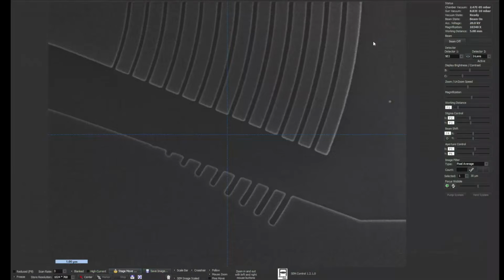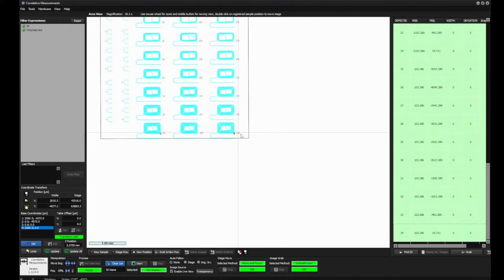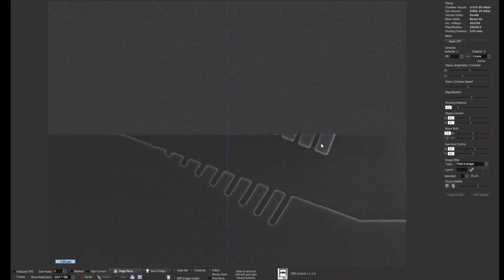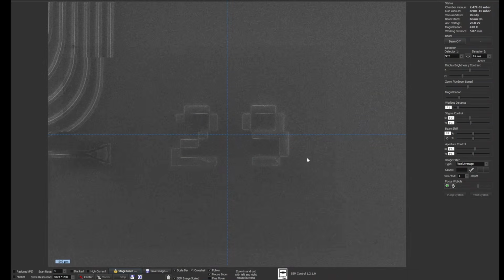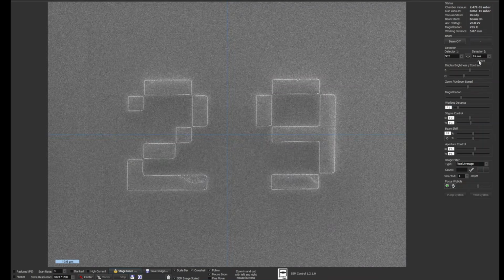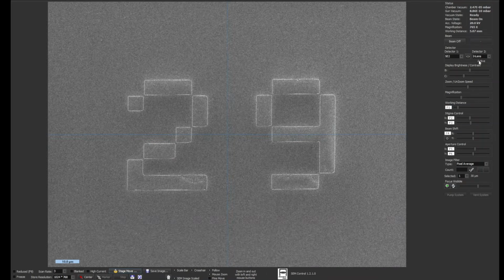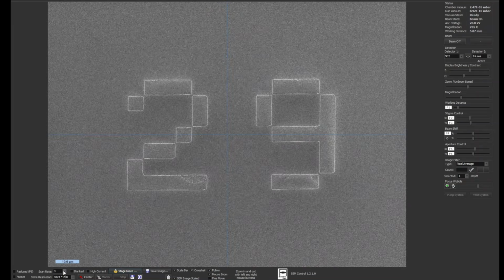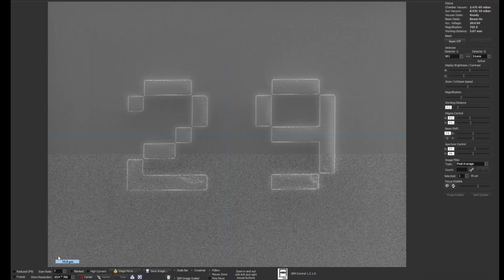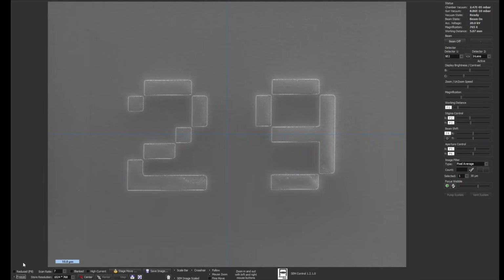define some imaging recipe. Yeah, so let's go here to the center of the number and go to the SEM side. We want to create an image like this size, maybe, yeah, with the in-lens detector. This is okay. We have 20 kilovolt acceleration voltage, maybe scan rate something like 7. Now this will at least work. Maybe we can also use 6. Well, that's just for making it faster.